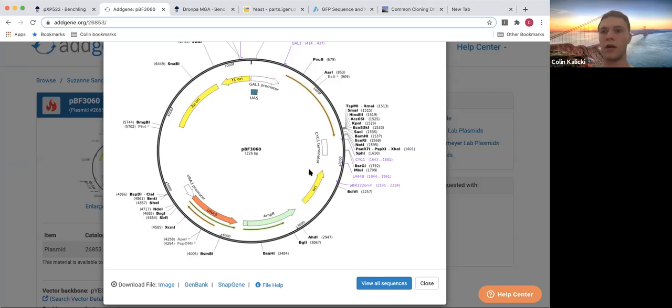So why do you think you have, so replication, right? You want this plasmid to be repeated over and over again. You don't want just one plasmid in our source. So for example, you create your replication fork, and so on and so forth, at these sites. That's where the plasmid would just get looped around really quickly and replicated a ton. So you get a lot of this DNA, because you want a lot of this DNA. These aren't really super cheap. The full plasmid could cost $700 to $1,000. You want this to replicate.